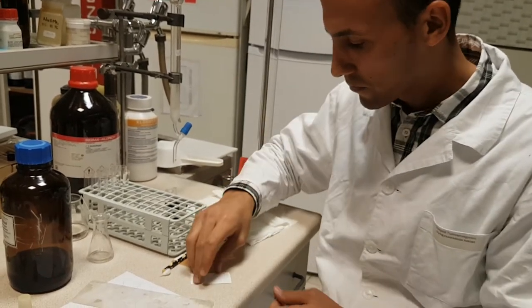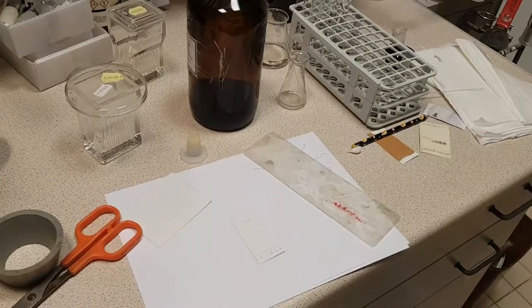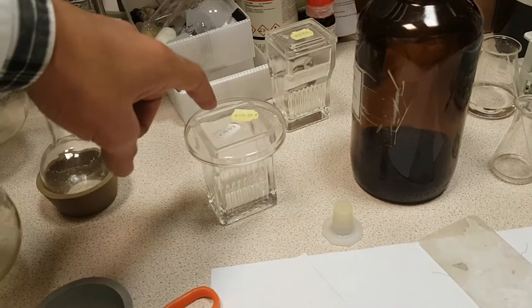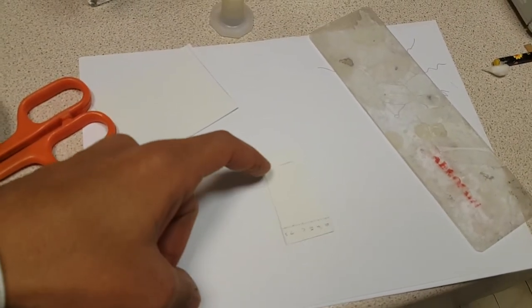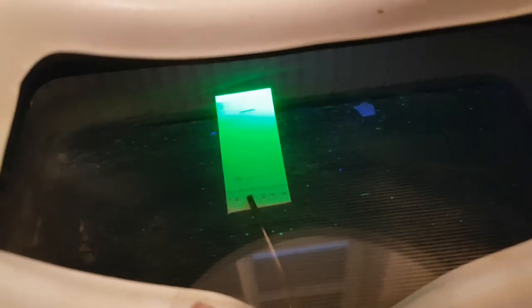Now we will use the UV in order to see our spots. Of course, don't forget that the TLC plate needs to be put inside the chamber with the solvent system you prepared, to allow the migration of your spots. Like that, we can't see anything on the plate, but using the UV, we are now able to see our spots. Our spots are very strong in tube 6 and tube 7.